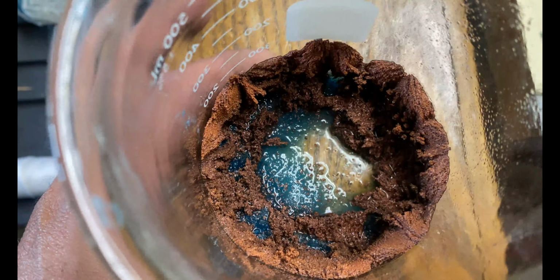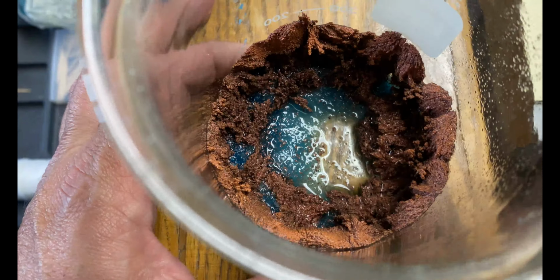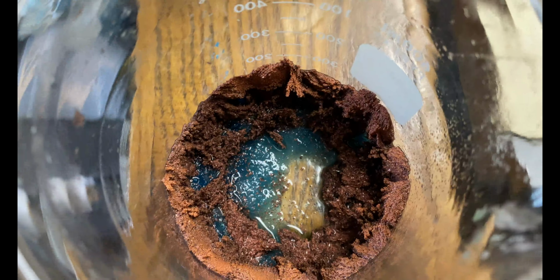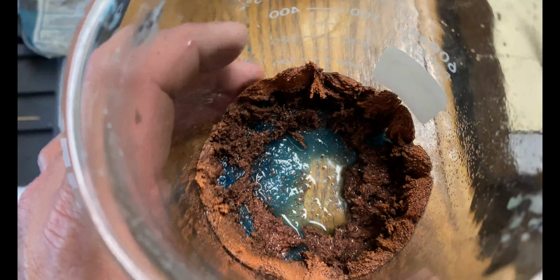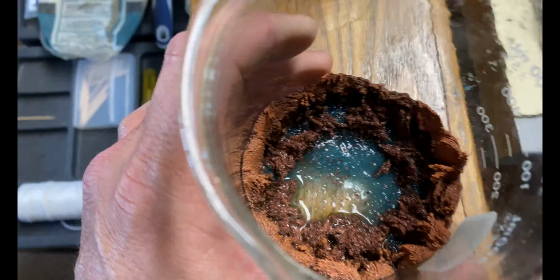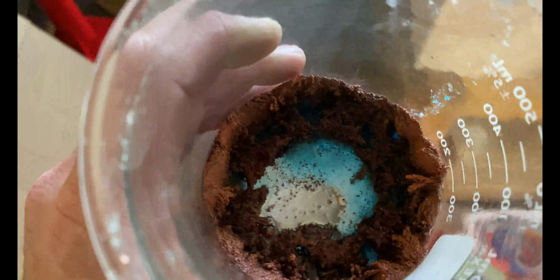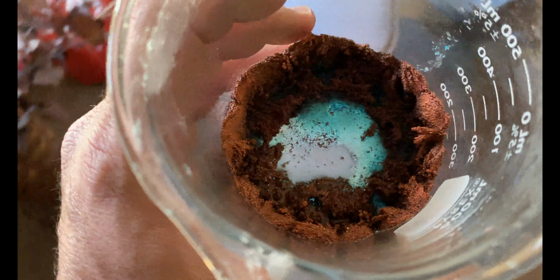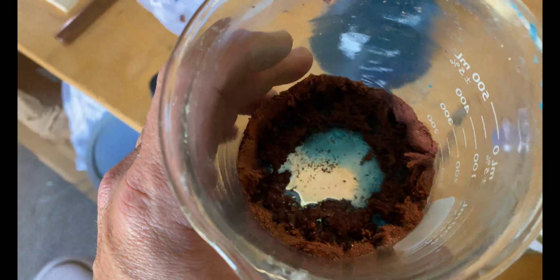I'm gonna put some water in here and try to get the remaining vitriol out, and then we'll let it dry. And we'll run a similar experiment to make green vitriol because, like I said, apparently the reaction doesn't need to go to completion to get the solid form. Had I let it stay to completion, I think it might have damaged the structure. So I was just kind of going on an instinct there.